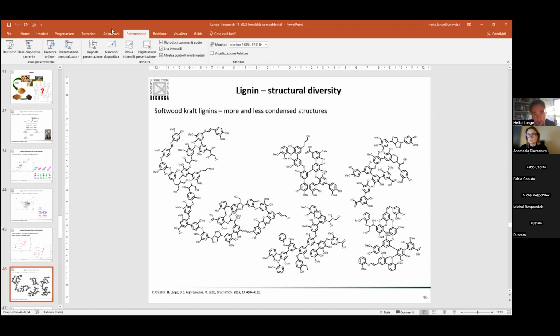Well, it is based on a Bruker sequence. You just add the additional pulses, etc., in order to get rid of the back coupling artifact. He published the sequence.